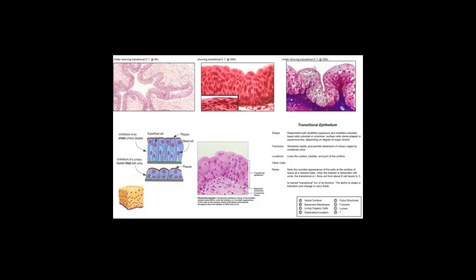the bladder is filled through the ureter and the filtrate accumulates, you're going to see a transition from these cuboidal cells in an empty bladder to a stretching or a distended wall, and that transition would be to a more squamous type appearance. You can see a nice view of the basement membrane here, and then approximately 4 or 5 layers of anywhere from cuboidal to columnar type cells that then become squamous in a distended bladder.